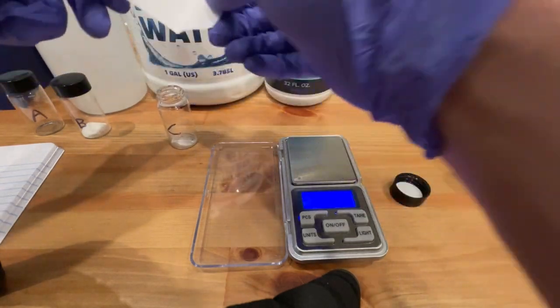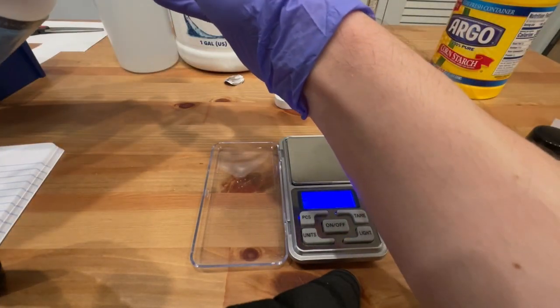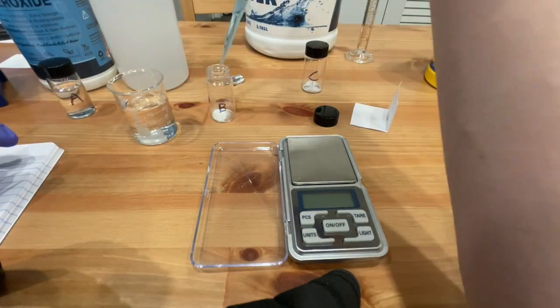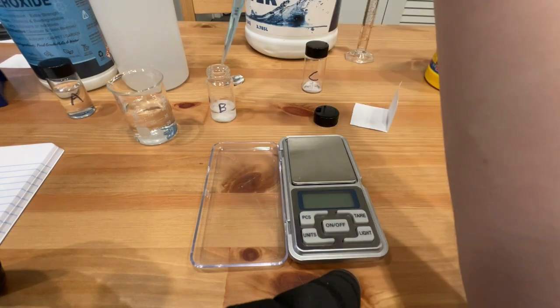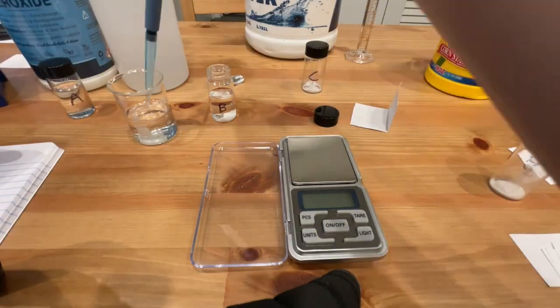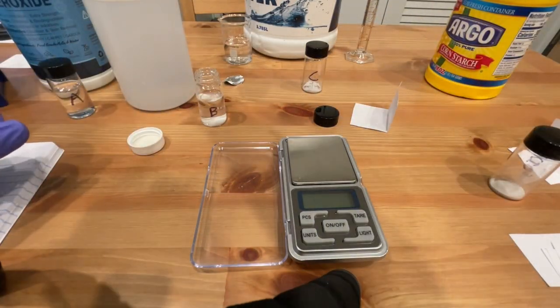Then, wet ingredients were added. 15 milliliters of 12% hydrogen peroxide was added to vial A. This is the only component in vial A. Then, 13.8 milliliters of deionized water was added to vial B. I'm not sure why I decided to add over 10 milliliters of fluid to something with a 1 milliliter micropipette, but here I am doing it anyway.